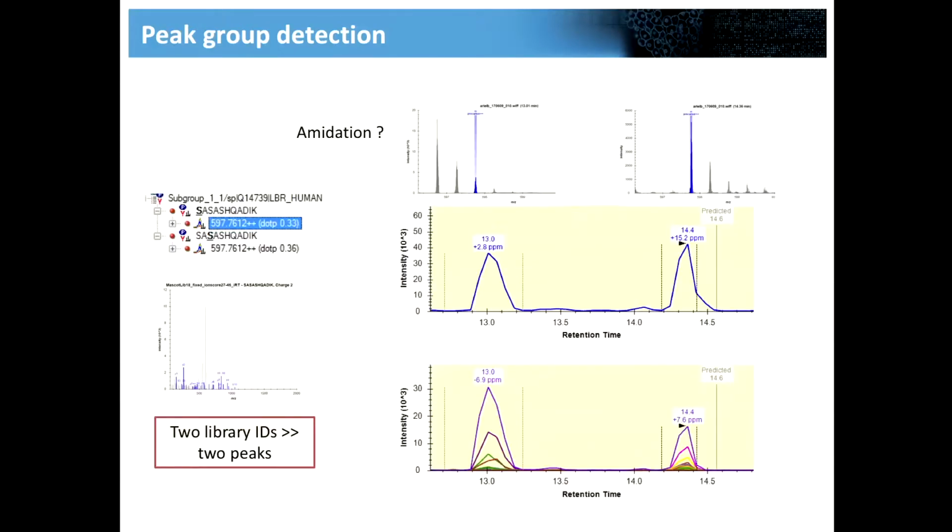Not always the case. Sometimes we have 2 peaks. We have, as I've shown you before, also 2 peaks at the MS2. In this case, we extracted the monoisotopic peak, and in this case, we extracted something else. Perhaps it's an amidation. So this peptide was modified by another modification, acquired, of course, within the same window, because this is a 1 Dalton shift.